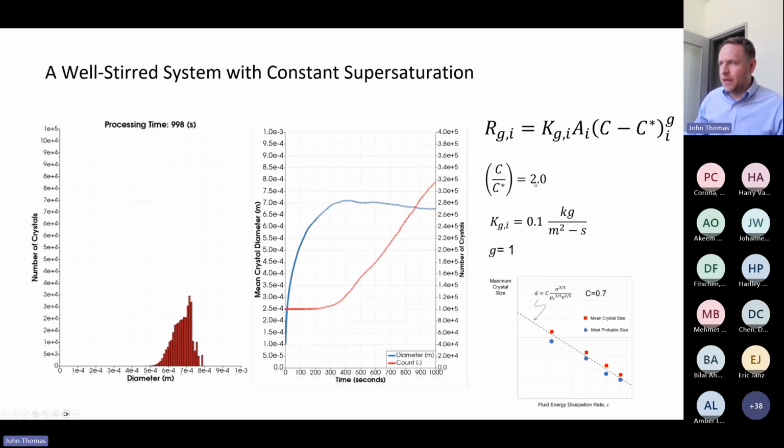If we kept this value higher, we would see more crystals, but that wouldn't change the max size, okay? If we changed our impeller speed, for example, that would inform our max size. But the max size is a kinematic property. The number of crystals is a function... I'm sorry, I said the max size is a mechanical property. The number of crystals is going to be a function of the actual driving potential and the saturation levels.